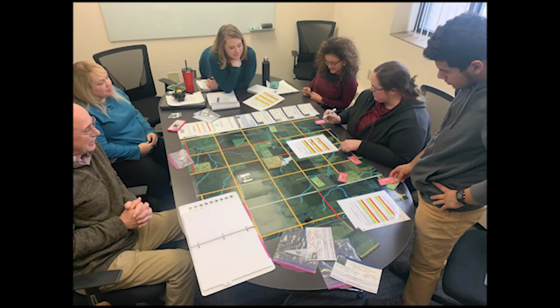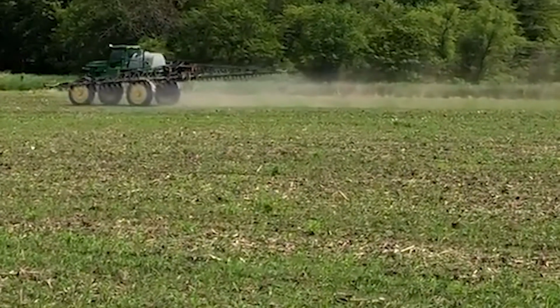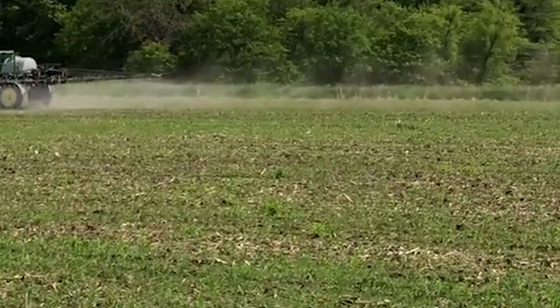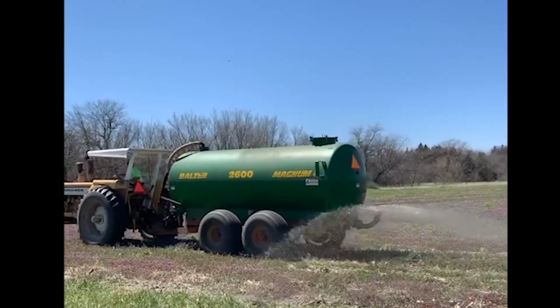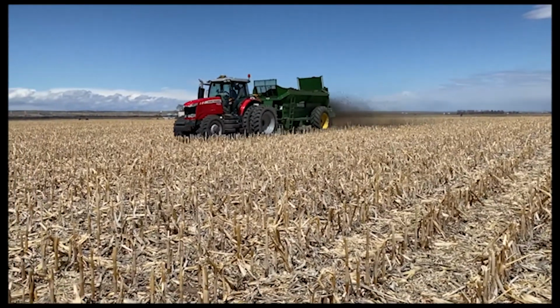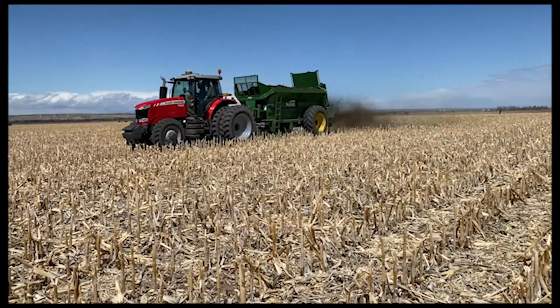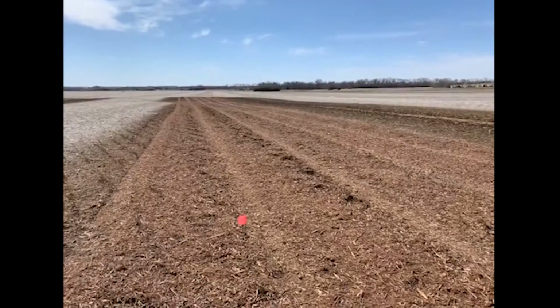So when we in the Schmidt lab want to find out what effect an organic treatment will have on soil conditions in agricultural lands, one of the things that we can do is measure how much CO2 is released from soil that has had different organic treatments. And we do this by measuring carbon dioxide released indirectly through titration.